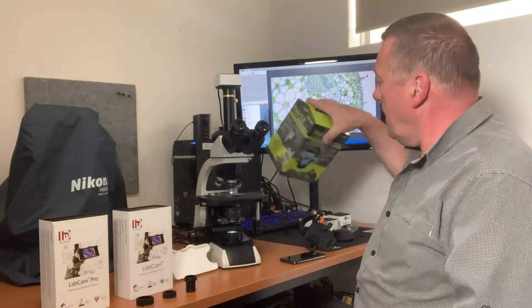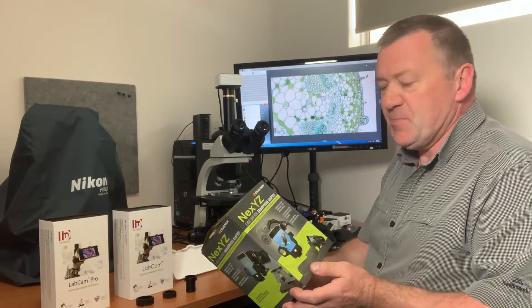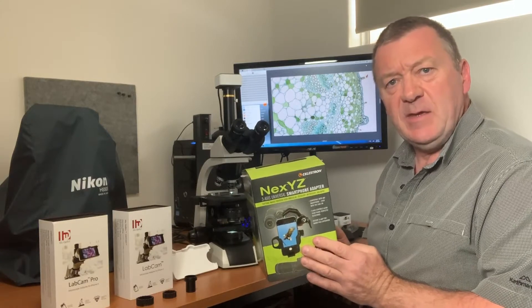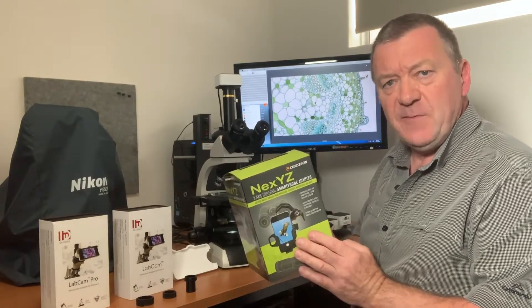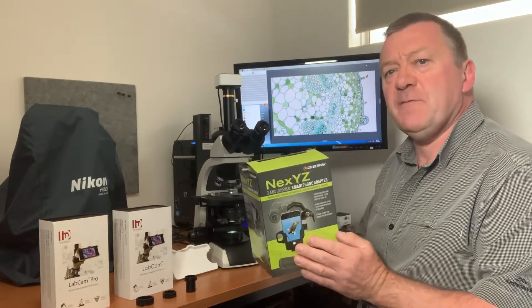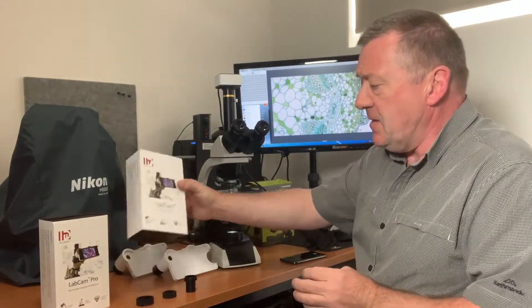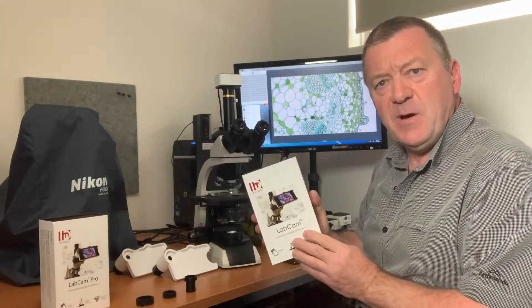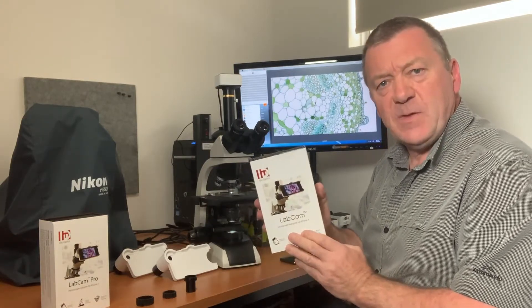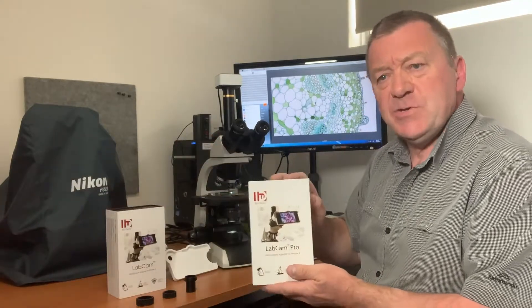I'm going to be showing you the Celestron NexYZ smartphone adapter. This particular adapter you can use with any smartphone — all the iPhone range and Android smartphones. Then we've also got the dedicated iPhone smartphone adapters: the LabCam original version and also the new Pro version.